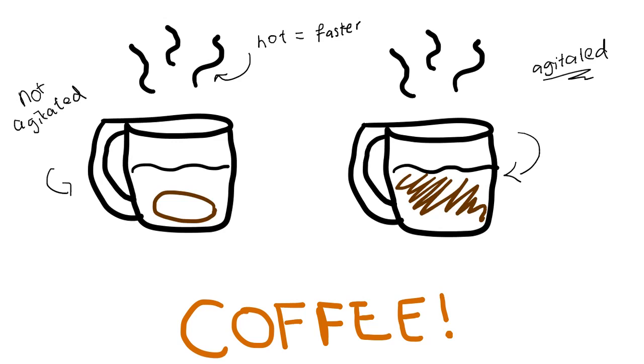But if you don't stir something, it's not going to cook itself, it's not going to do anything, right? And the ones that were agitated, think about that. It would be a lot faster. Do you think it'll make a great cup of coffee if you stir it up? When you stir it up, a few of them will dissolve faster, and the rates are all different, of course. I'm sure the pellet will take a lot longer because it has to break down a lot more. But the fine grained one would take a lot less time because it's already fine grained. So, see what I'm talking about?